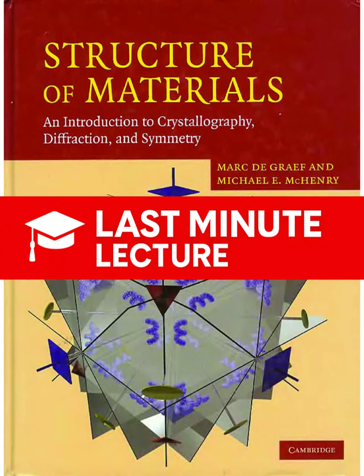For a fixed material and a fixed wavelength, diffraction will only occur at discrete, predictable angles. And the integer n is the order of diffraction. The source mentions that we often absorb n into the definition of the Miller indices. Can you clarify that? Certainly. So imagine you have a first-order reflection, so n = 1, from the (100) planes. That happens at a specific angle. Now, if you look for the second-order reflection where n is 2, the equation is 2d sin θ = 2λ.